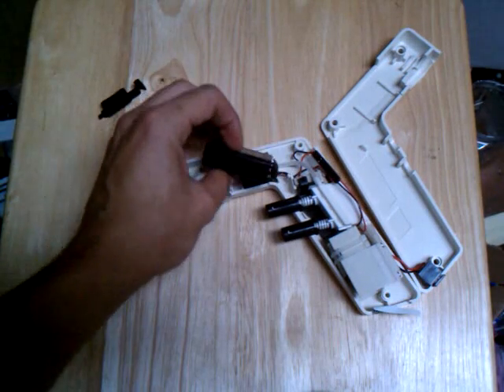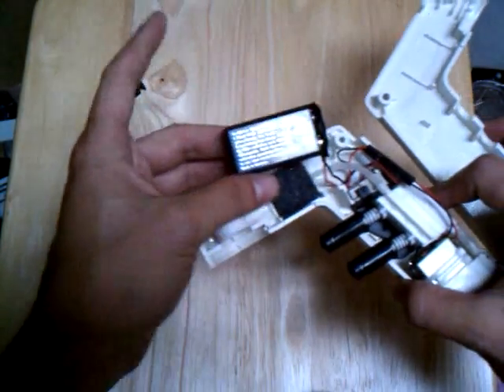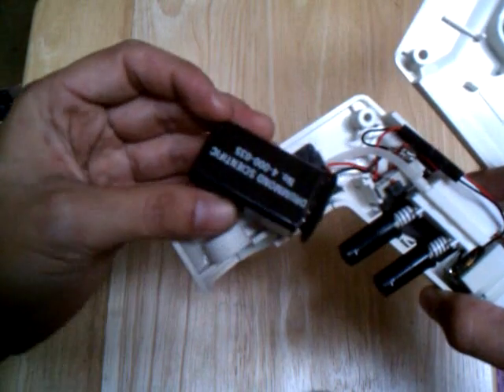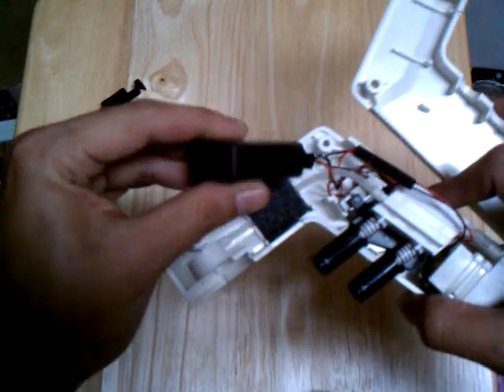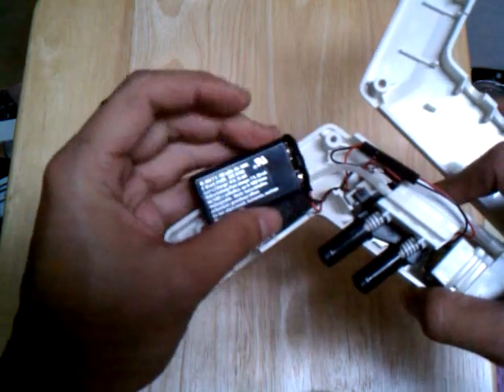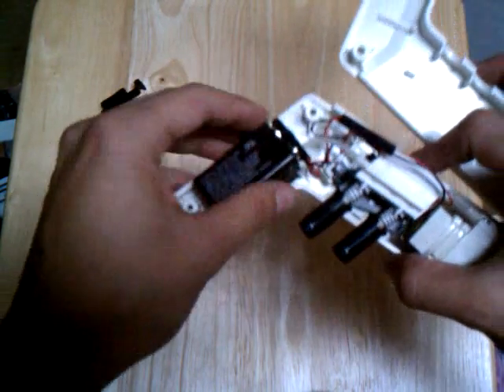Good stuff in here. For instance, this 7.2 volt nickel metal hydride cell. The great part is, like a 9 volt, it's really just six small cells stacked up that combine to make 7.2 volts. I will be using this very shortly.